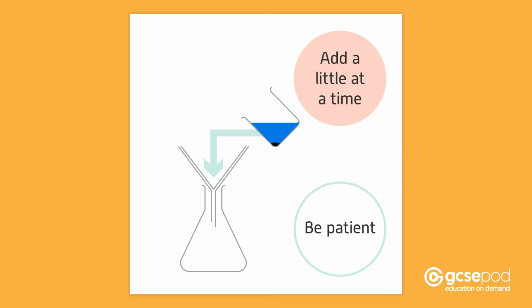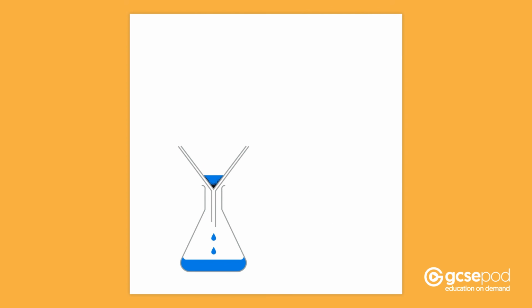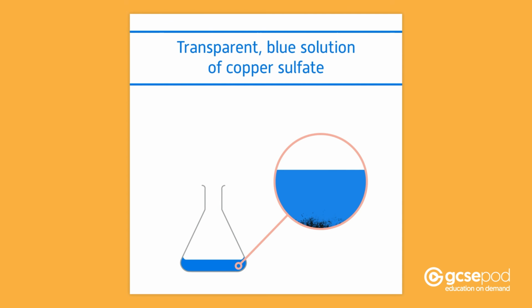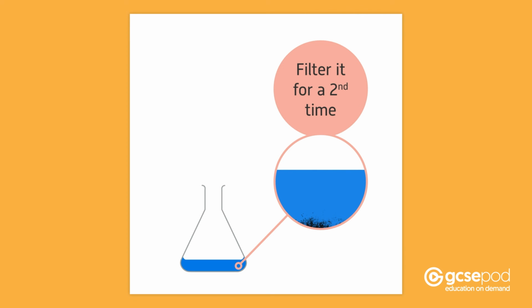You should add a little at a time, making sure it does not go over the top of the filter paper. The filtrate will drip through into the conical flask. It is a transparent blue solution of copper sulfate. If there are any particles of black copper oxide, then you will need to filter it for a second time.